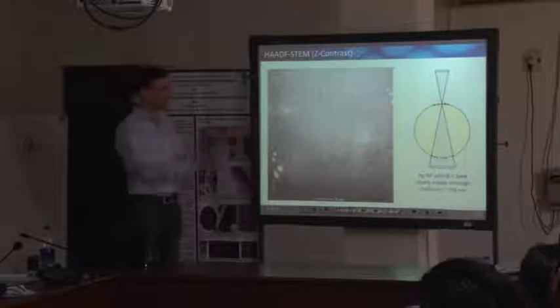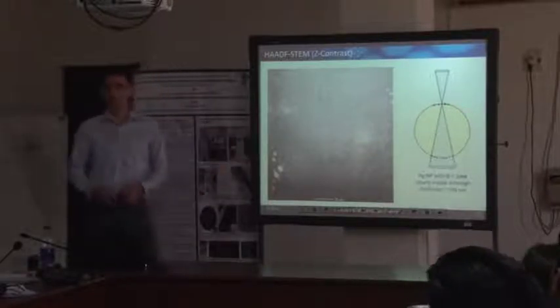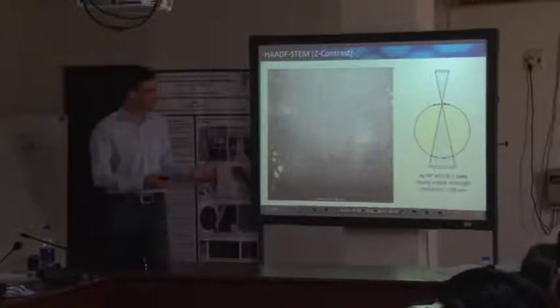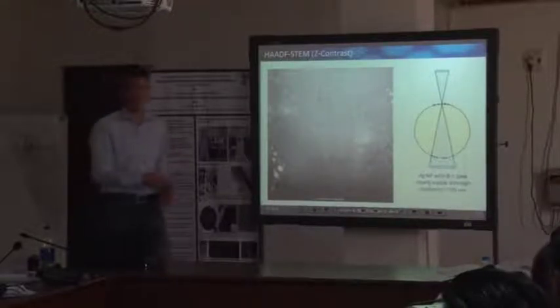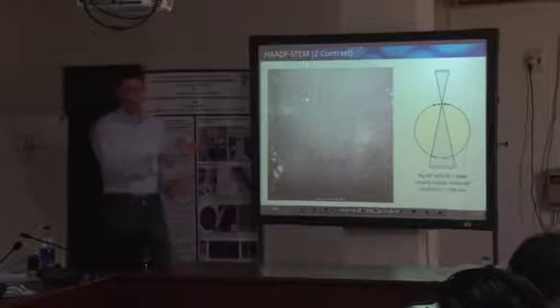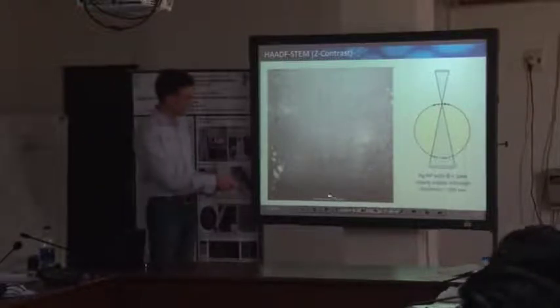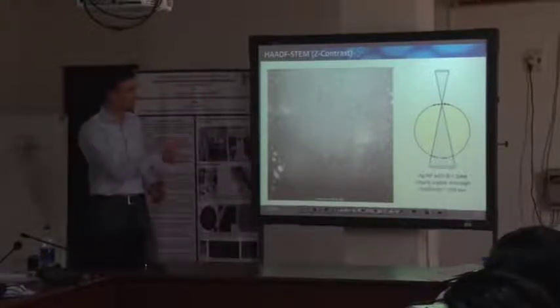In this particular case, you always have, to a certain extent, some multiple scattering within the material. But in principle, we are able to visualize the distribution of very fine particles, as you can see here. This is due to the fact that the silica is amorphous, so there is no Bragg diffraction. And the silica is pretty lightweight compared to these metal particles, so this is also a matter of contrast.